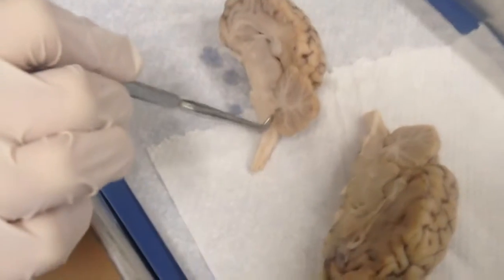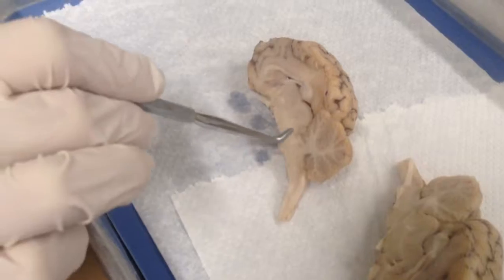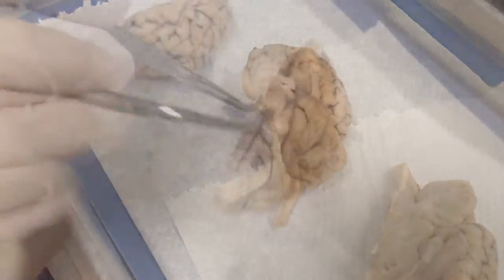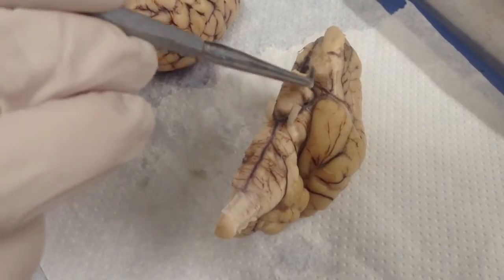So this area is the medulla, this is the pons, and this region is the midbrain. This is an optic nerve, this is another one, and this right here is the optic chiasma.